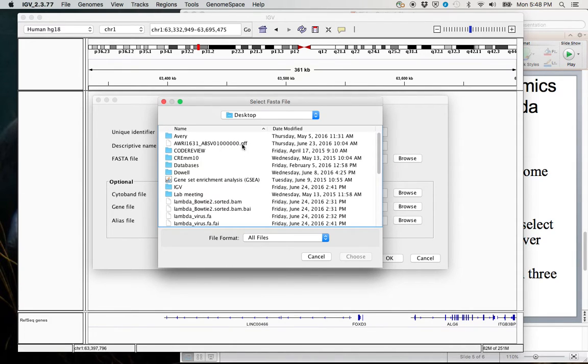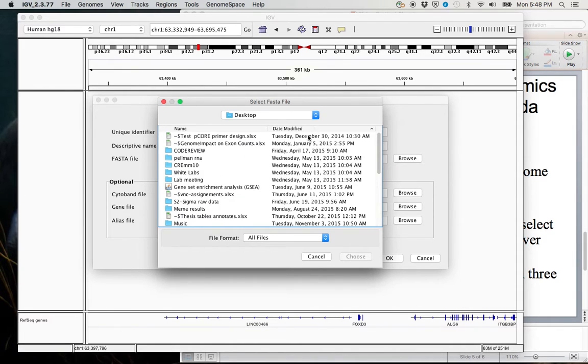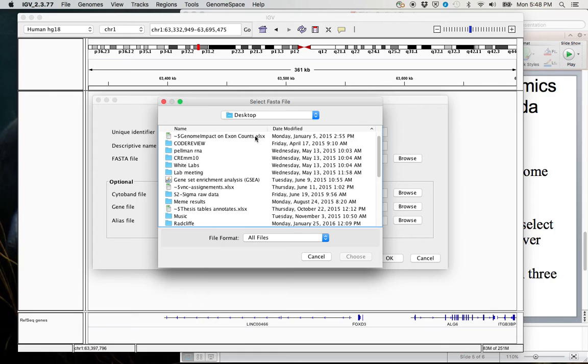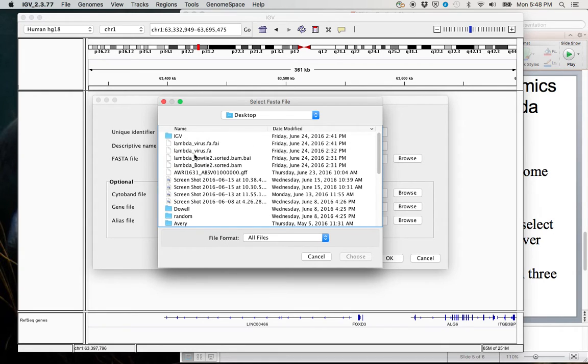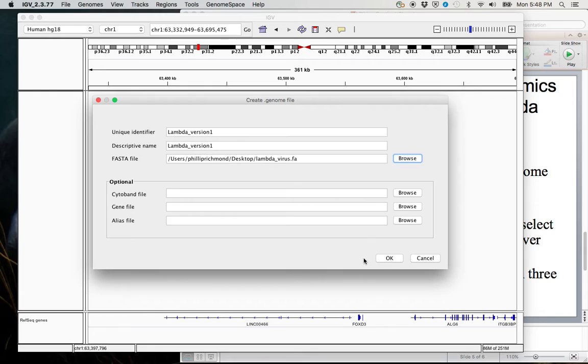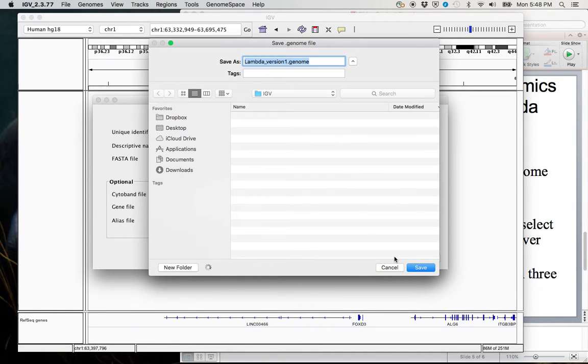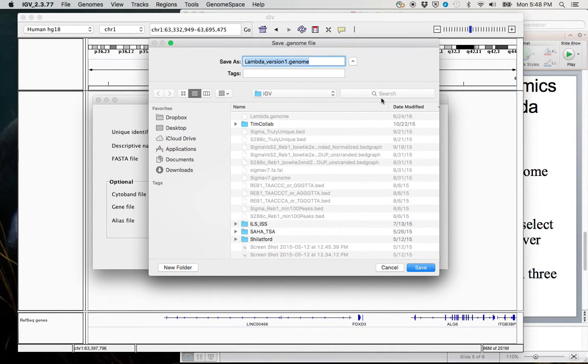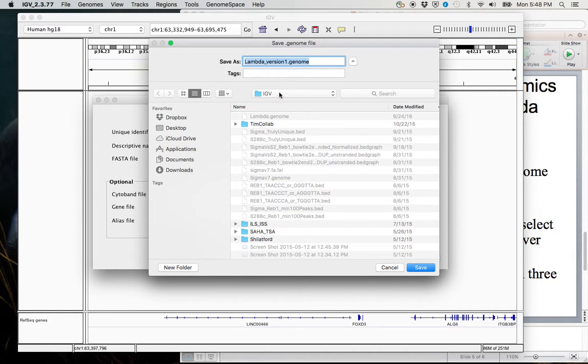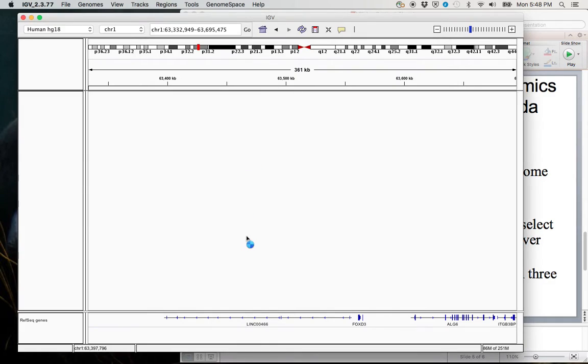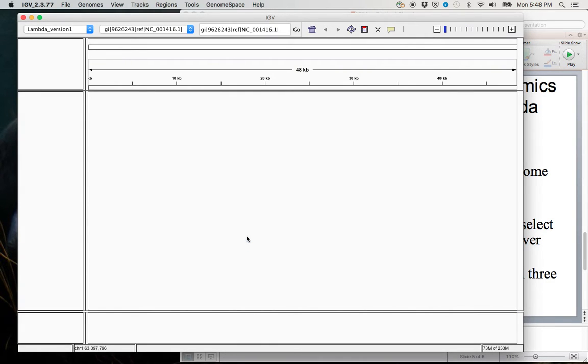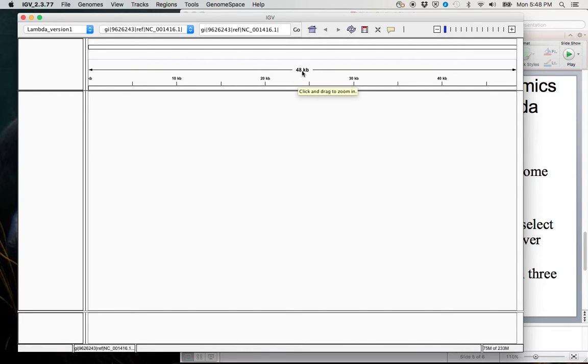The FASTA file now where we can browse our computer. We know that it's on the desktop. Recently added. So we want the .fa file. And we don't actually have any gene annotations, but if we did, we would put them here for the gene file. So now if I hit OK, it has to be where I want to save this. I recommend making an IGV directory somewhere on your computer. That's where I'm going to go ahead and save mine. I've already had this IGV directory on my laptop.